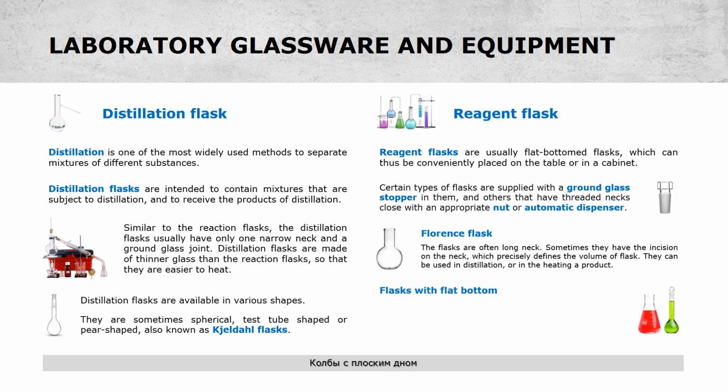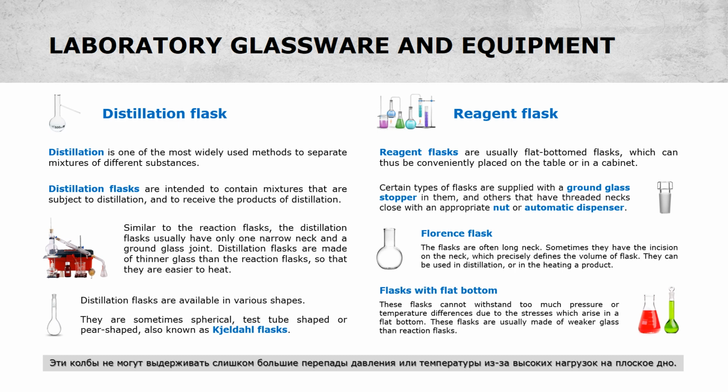Flasks with flat bottom. These flasks cannot withstand too much pressure or temperature differences due to the stresses which arise in a flat bottom. These flasks are usually made of weaker glass than reaction flasks.